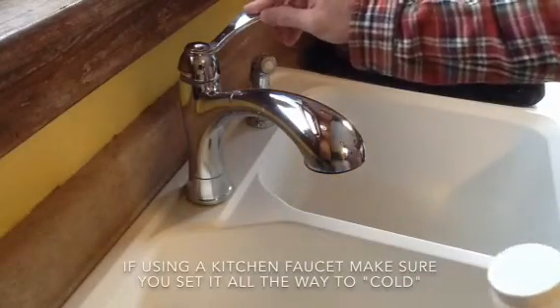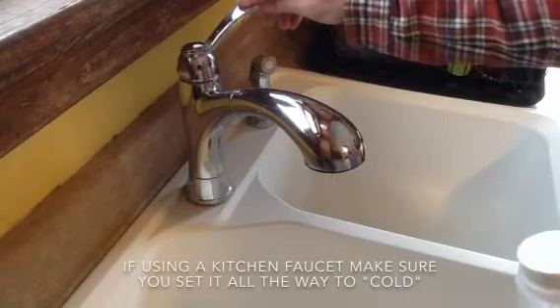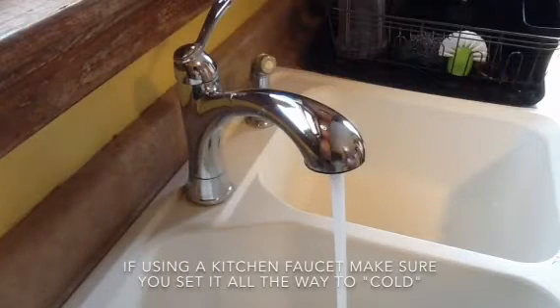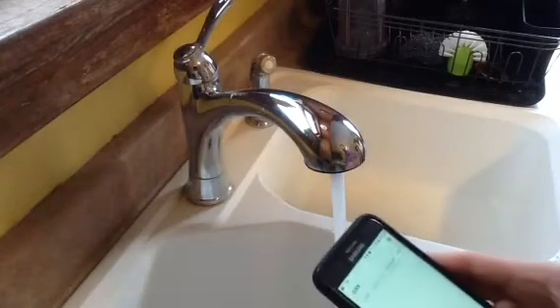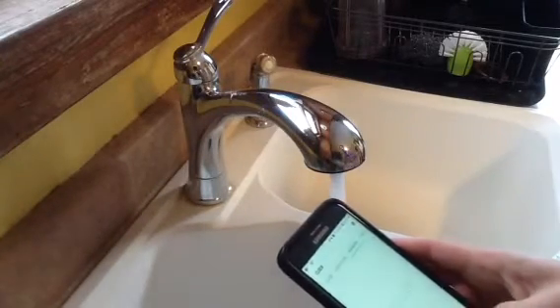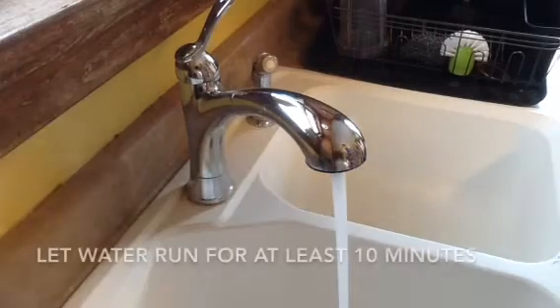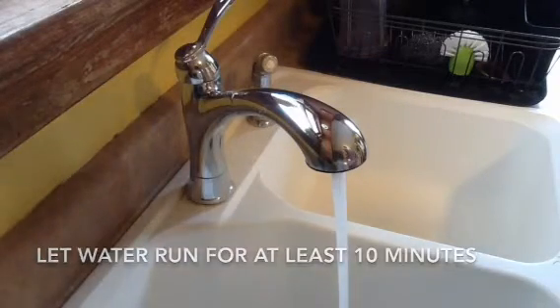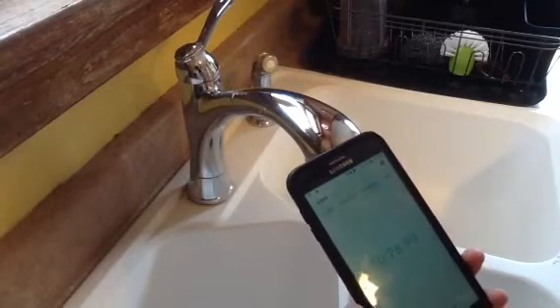If using the kitchen faucet, make sure you adjust it so that it's running only cold water. Turn the faucet on high so that we're flushing stagnant water from the system. We're going to want to make sure that this faucet runs for at least 10 minutes prior to getting ready to collect our sample. Here I'm going to start a watch to ensure the appropriate amount of time has passed. Adequately flush. After 10 minutes have passed, we are now ready to collect our sample.